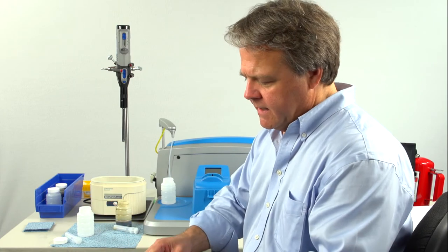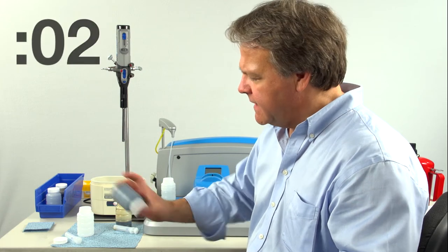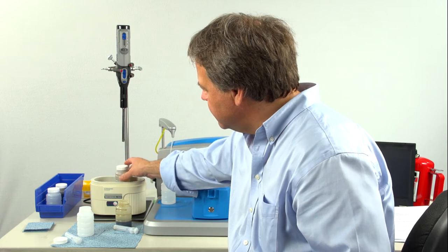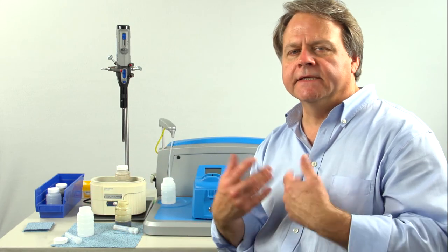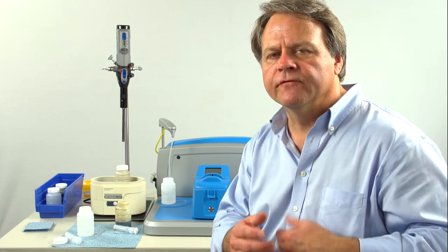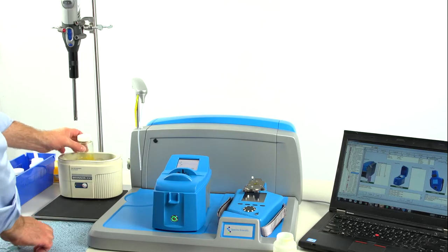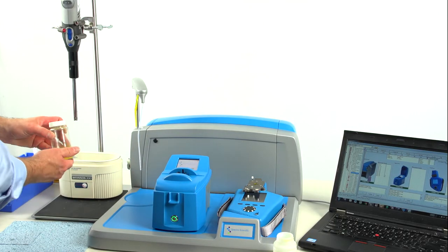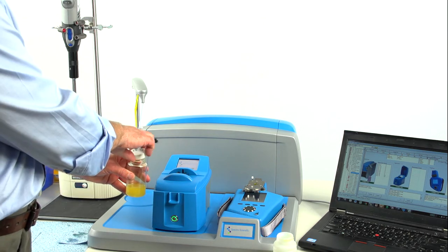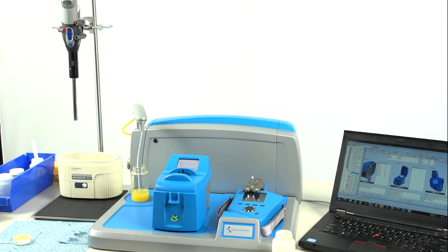Then once that's done, again agitate the sample for 30 seconds. Once the 30 seconds has elapsed, place it in the ultrasound, again for 30 seconds, and that will remove the air bubbles. So that is one methodology of preparing a diluted sample for analysis in the LNF. After the ultrasonic, which removes the air bubbles, we process the sample on the particle counter and ferrous monitor.